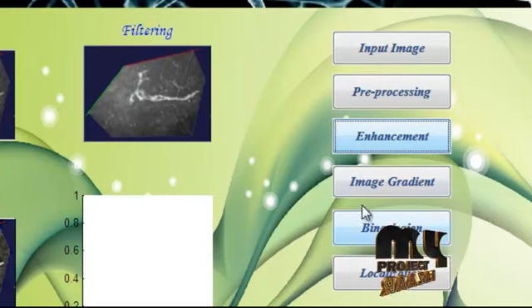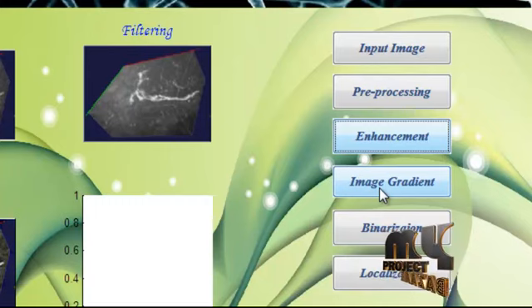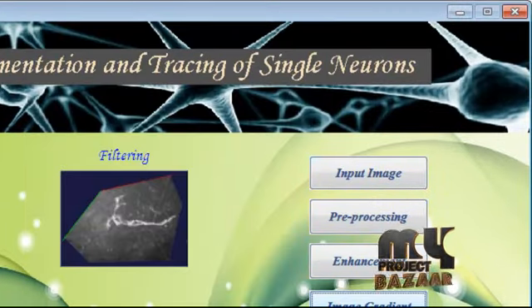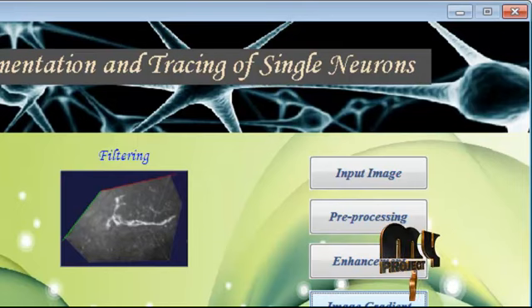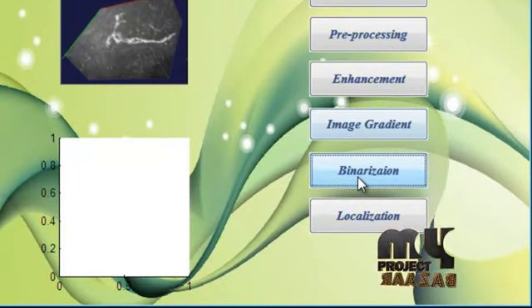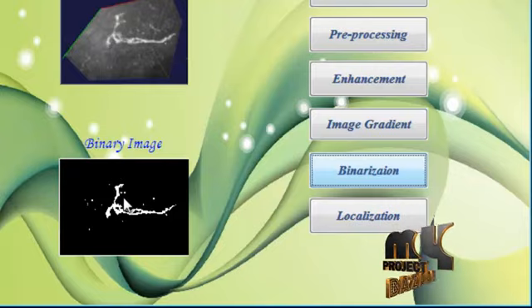The enhanced image is passed to the image gradient stage. The image gradient finds the edges of the image. This is the gradient of the image. The gradient image is passed to the binarization stage, where we convert the image to a black and white image by segmenting the neuron using a Gaussian-based method. If the pixel belongs to the neuron it is marked as 1; if not, it is marked as 0. This is the binary image displayed on the fourth axis.